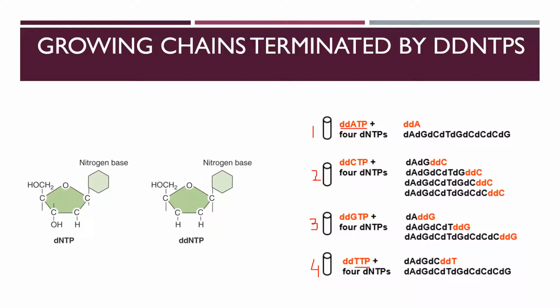The difference between the normal dNTPs and ddNTPs is that the ddNTP lacks a 3' hydroxyl group. The absence of the 3' hydroxyl group stops the elongation of the chain, and whenever a ddNTP is attached, there is no more elongation and the chain terminates there. However, if a normal dNTP attaches, then the chain termination does not occur and the chain elongates fully.